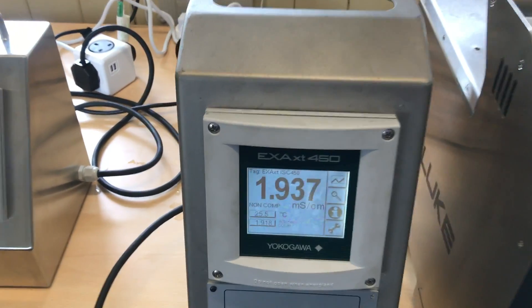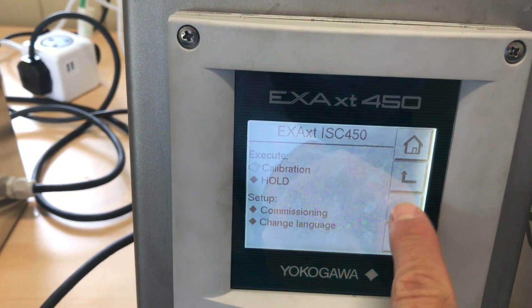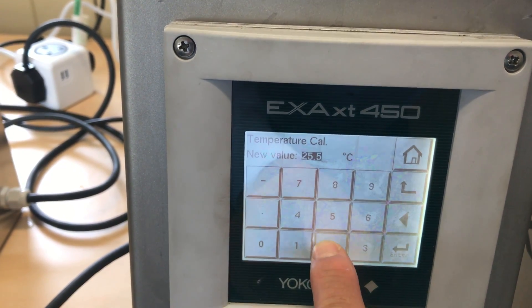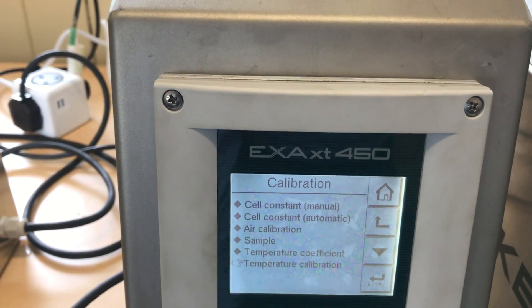We do need to calibrate its temperature sensor. We can carry out the temperature calibration just now because it's been very stable at 25 degrees centigrade. We need to apply the slight offset at that temperature.